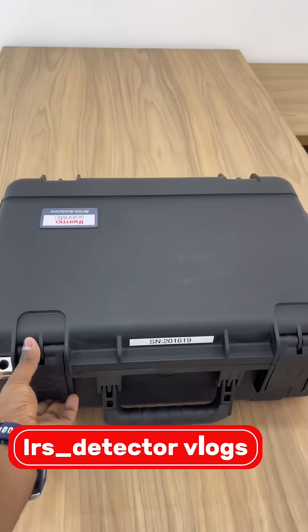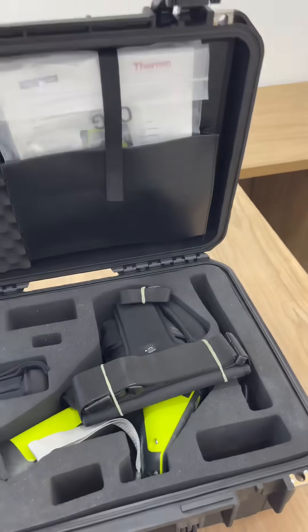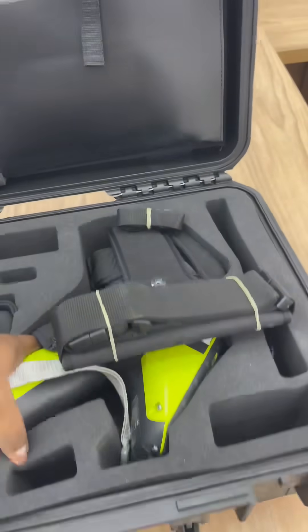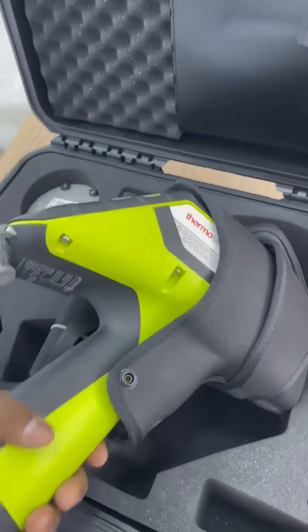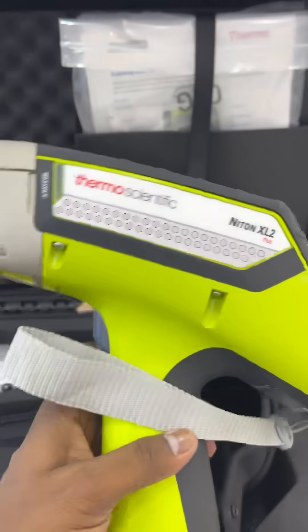Hi guys, welcome to LRS Detector Vlogs. This is an unboxing of the all-new XL2 Plus from Thermo Scientific.